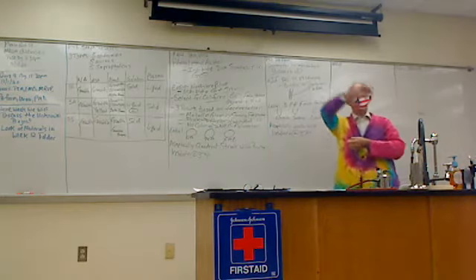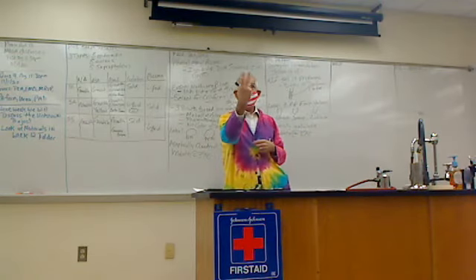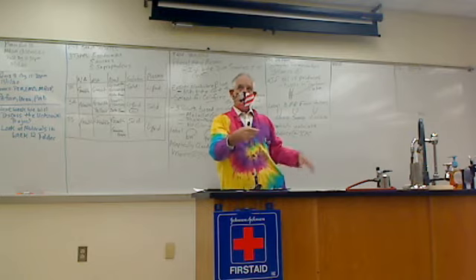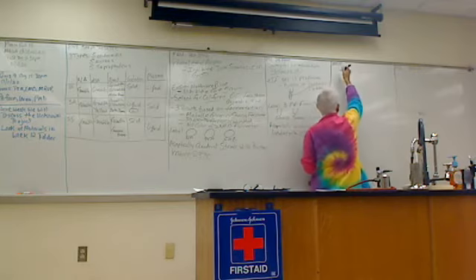Okay. Now the next one is also on that page, guys, and we have one tube that is going to be split into 2 next time after it grows to test for 2 different things. Okay? So the tube that says MRVP is for the following.